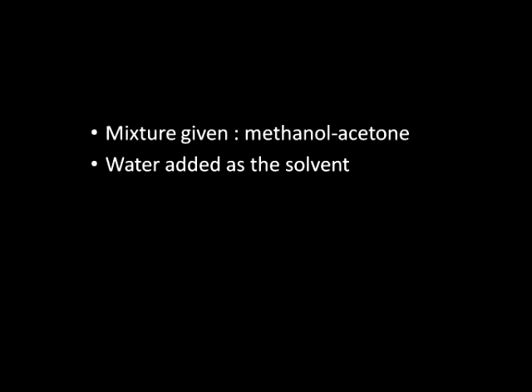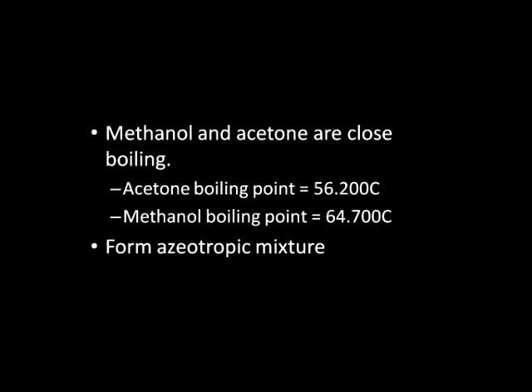Experimental setup. The present multi-component vapor-liquid equilibrium system comprises methanol, acetone, and water. Methanol and acetone are fairly close boiling. Acetone boiling point 56.2 degrees Celsius. Methanol boiling point 64.7 degrees Celsius. In addition, methanol and acetone form a minimum boiling azeotrope. In the present experiment, water is added in order to break the azeotrope.